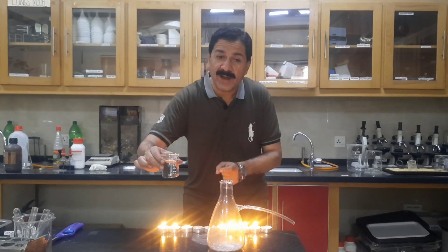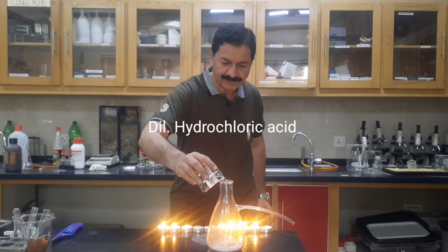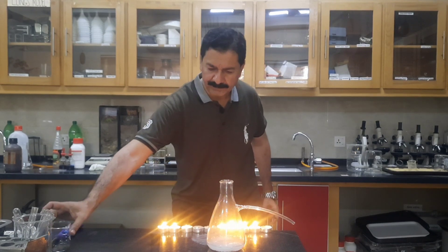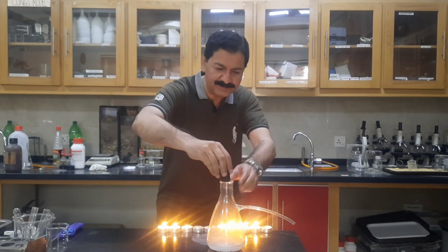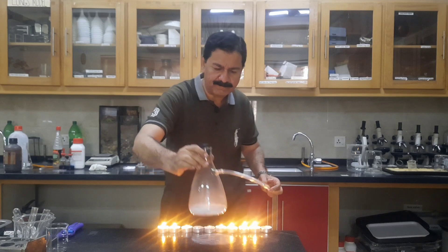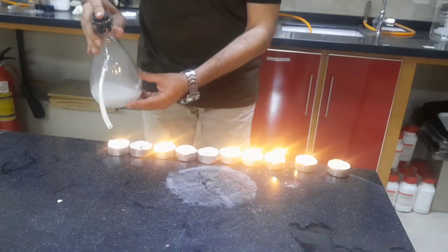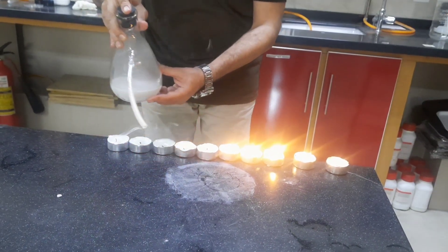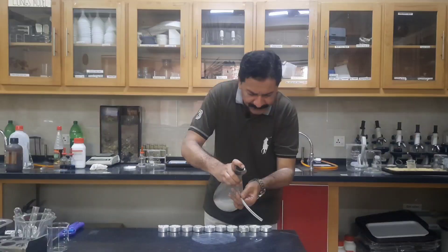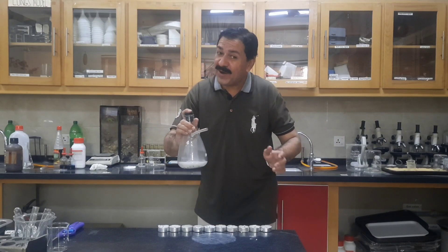Now, I am going to add Dilute Hydrochloric Acid in the flask. Insert in the cork. You can see a very fast reaction — bubbles produced. And I will prove that carbon dioxide gas is a fire extinguisher.